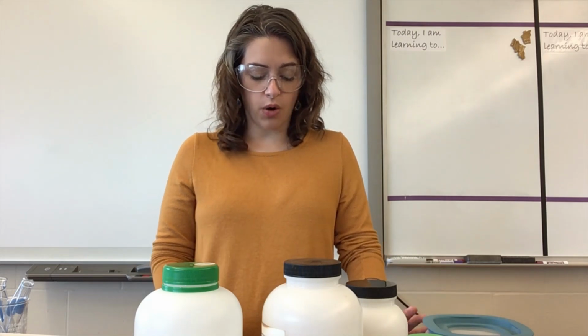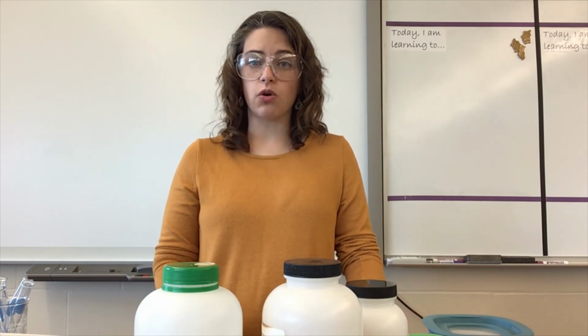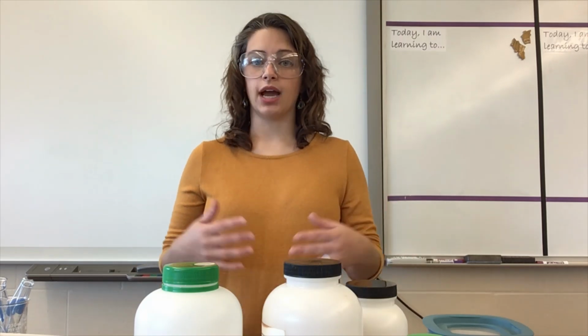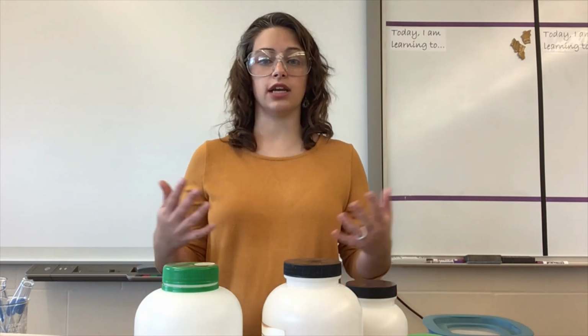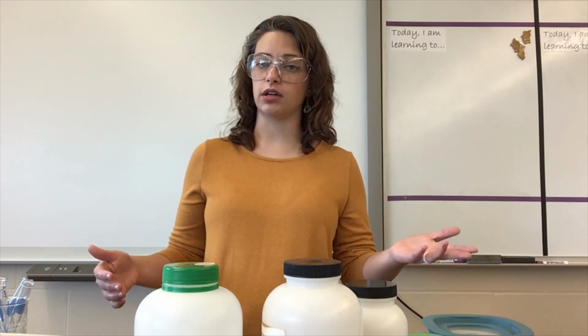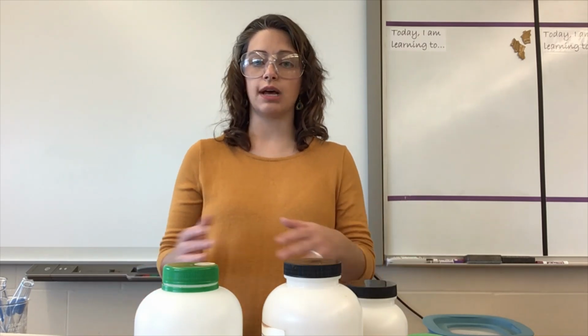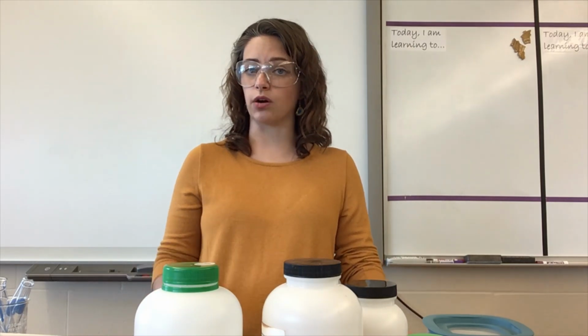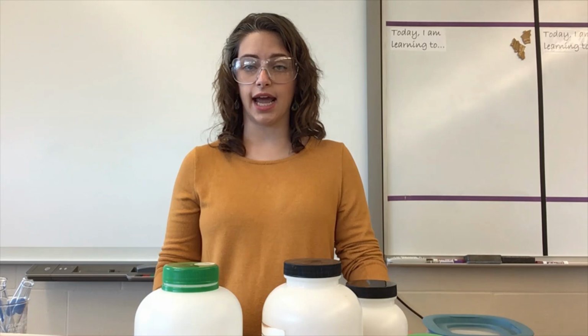So in part one for our method, we are going to explore properties of a selection of different compounds. And we're going to see how they behave. We're going to then use those properties combined with our knowledge about types of elements to separate them into different categories. So there are two main categories, ionic and covalent.